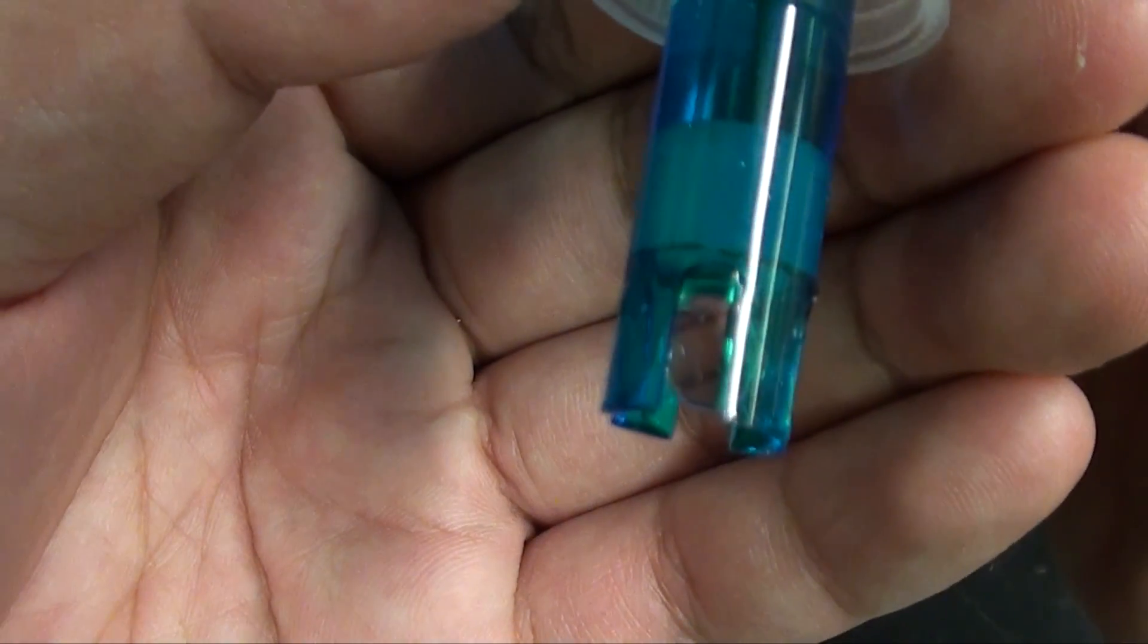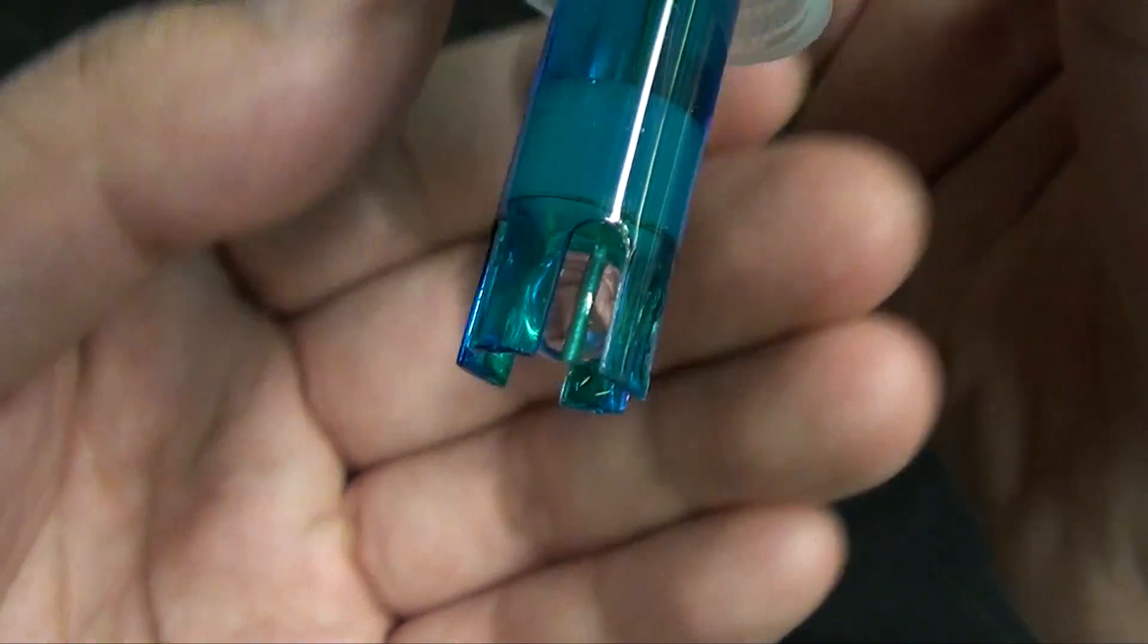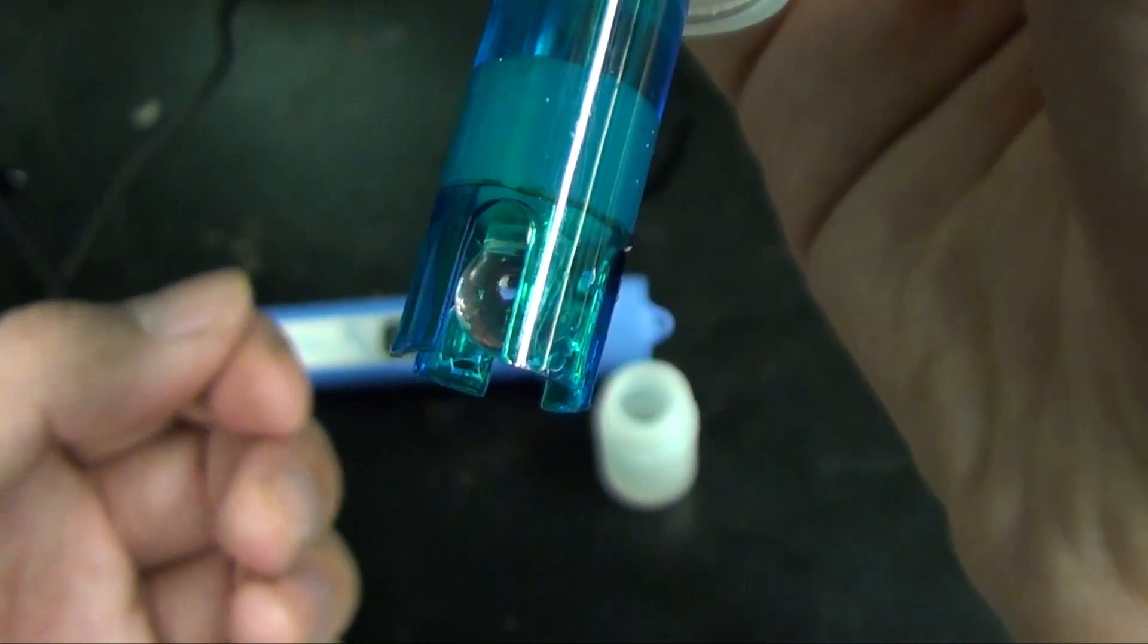And here it is. This glass bulb is what measures pH. If you look inside there is a metal wire. This wire is the inner reference electrode that measures the potential across the glass.